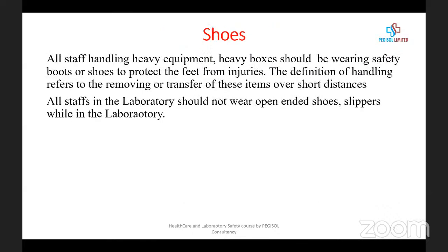So for shoes, staff handling heavy equipment or heavy boxes should be wearing safety boots or shoes to protect the feet from injury. That's the major reason why we say when you walk in the lab, your shoe must not be open, it has to be covered.